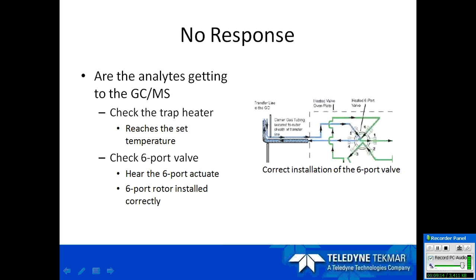The first and main thing you want to make sure is that you hear the valve actuate. If you hear the valve actuate, you know you have power to the valve, and the valve is actually rotating inside. So that will help you eliminate a couple more problems down the road.